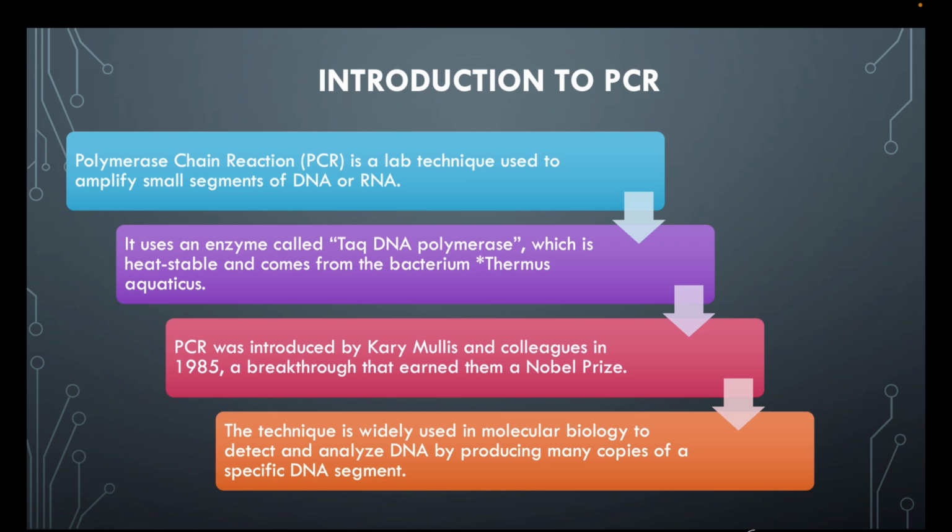This DNA region can be anything the researcher is interested in. For example, it might be a gene whose function a scientist or student wants to understand, or a genetic marker used in forensic labs to match the crime scene DNA with suspects, or for parentage matching like paternity testing, etc. Typically the goal of PCR is to make abundant copies of the target DNA region so that it can be analyzed or used in some other way.